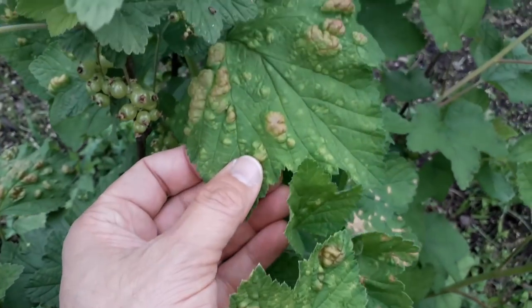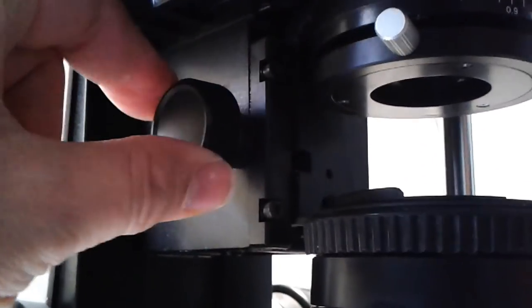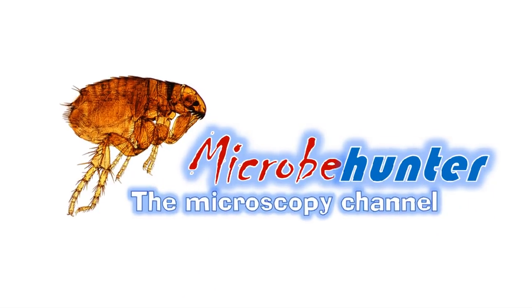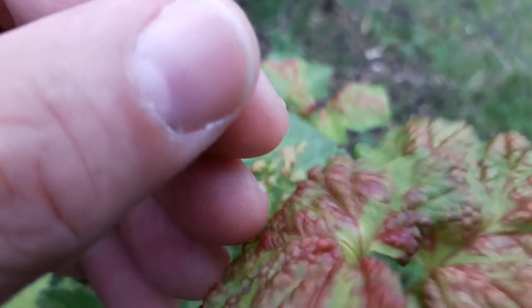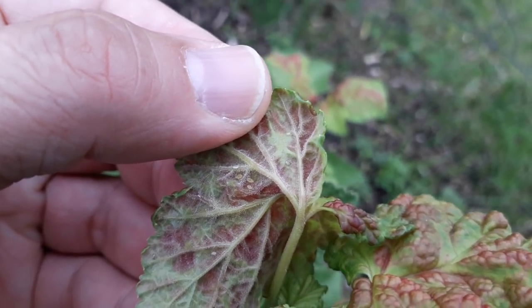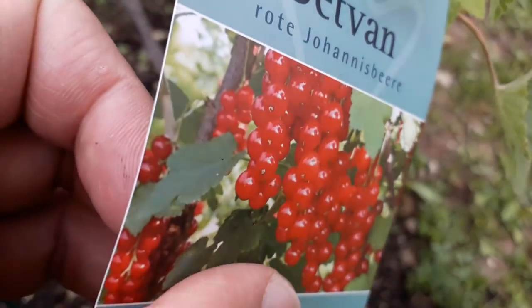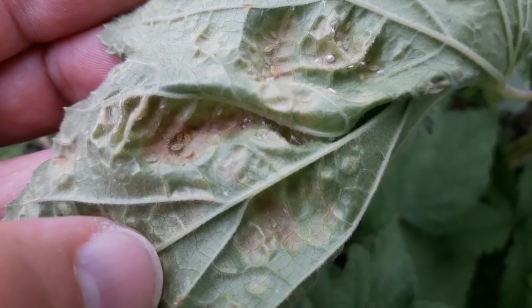So what I did is I put them under the microscope. The leaves look dried up, they look red, they look really horrible. The plant is really ill and when you turn the leaf around you can see those white dots — these white dots are the insects. They're called aphids and what they do is they suck the sap of the leaf. These are the berries; I was expecting in a few weeks to get them but I'm worried the plants are not going to survive.